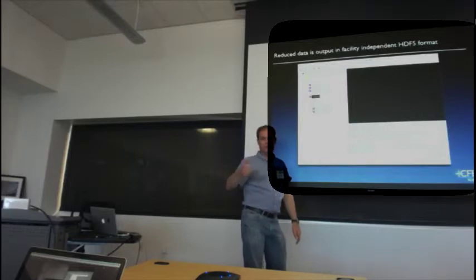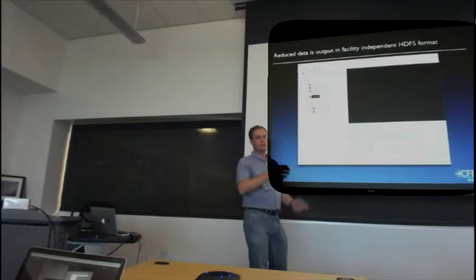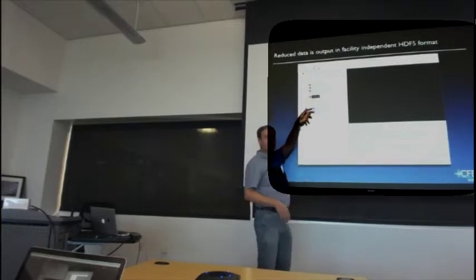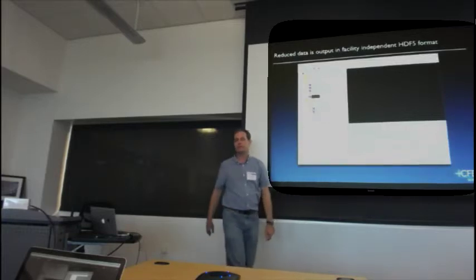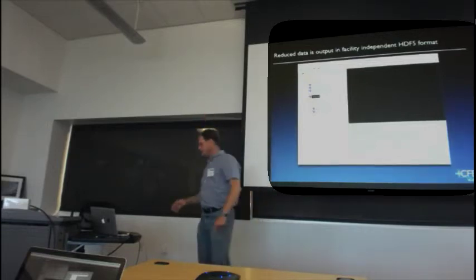So, for example, those burnt-in ice marks, I start saying, this pixel's bad, don't integrate data here. This is a hot pixel, don't integrate data here. This pixel looks stuck. This region of the detector is bad. You can put all of that into Cheetah. It's encapsulated in the HDF5 file as metadata, and you can pass it on to CrystFEL to say, don't integrate this bit of the detector because it's dodgy in some way.